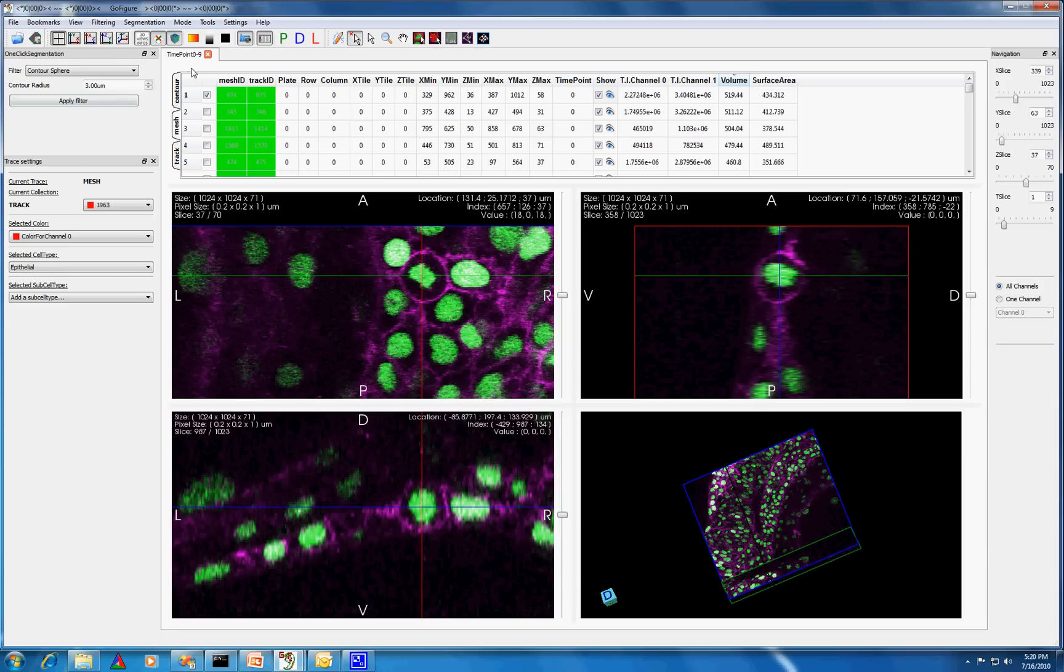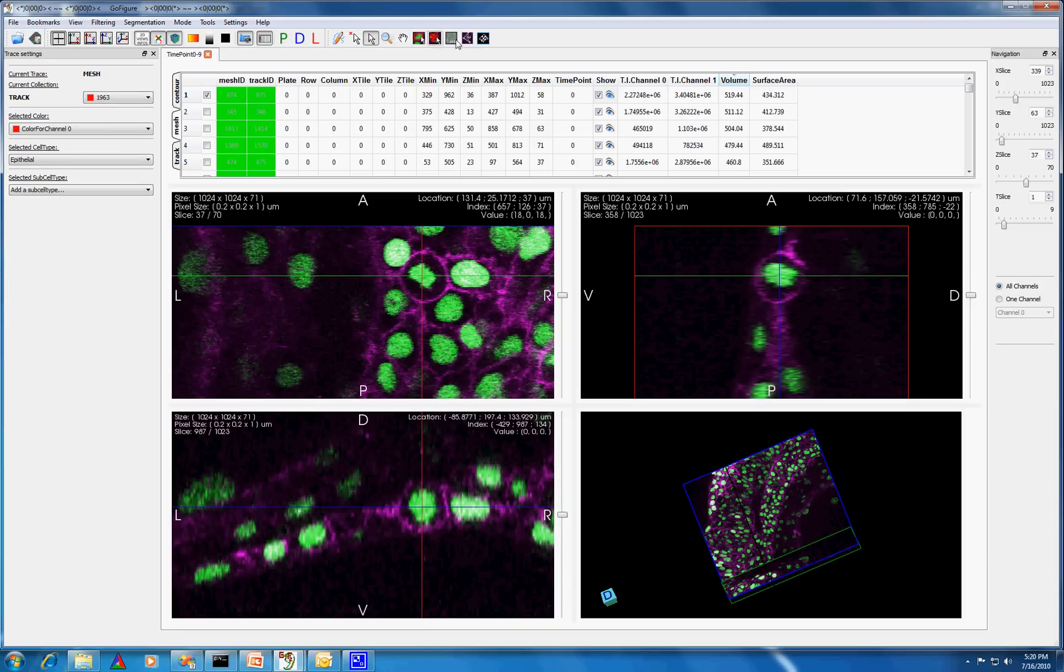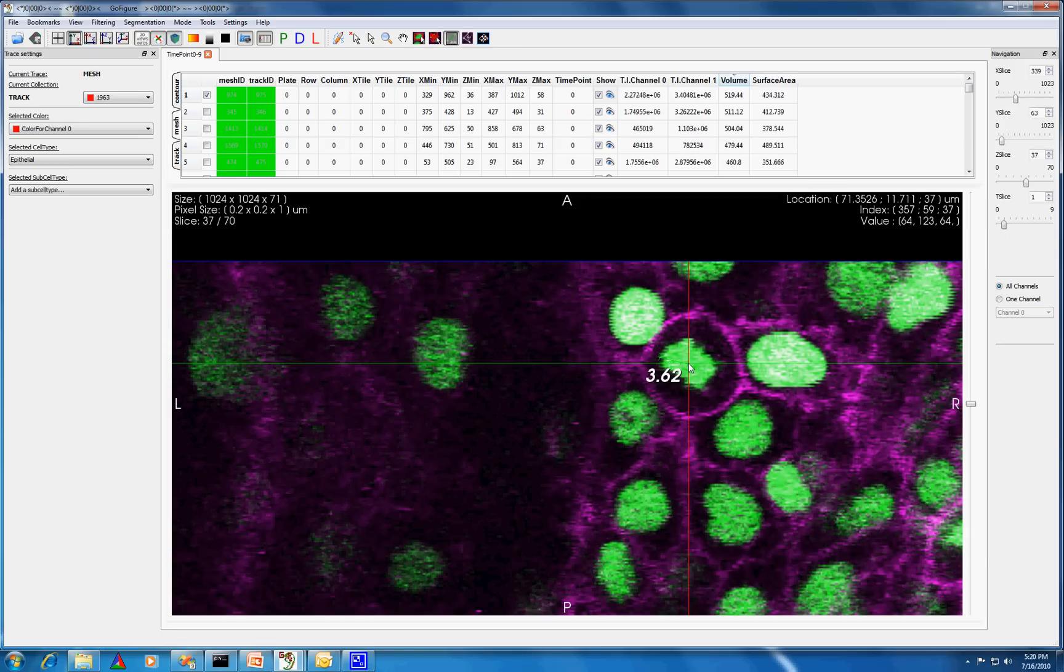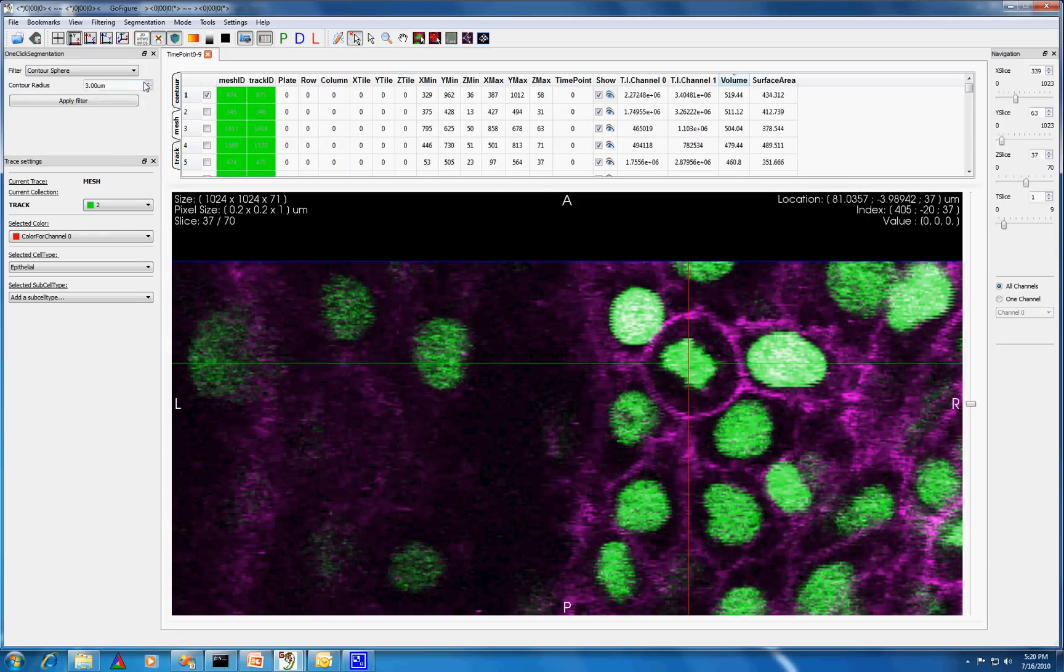Now I'll use the one-click segmentation to create my 3D mesh. But first, I'll get an idea about what radius to enter for the algorithm using the measure distance tool. Here it looks like 3.6 is a good choice for the radius.